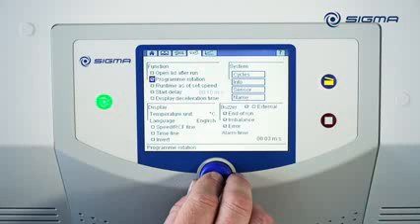If the Program Rotation option is enabled, the centrifuge processes all other saved programs after completing the first program and then goes back to the first program.